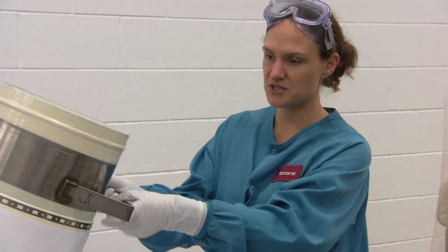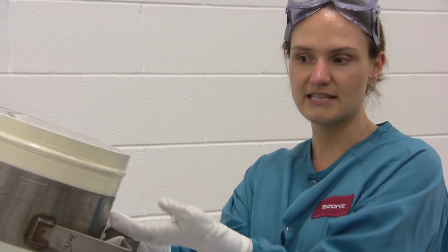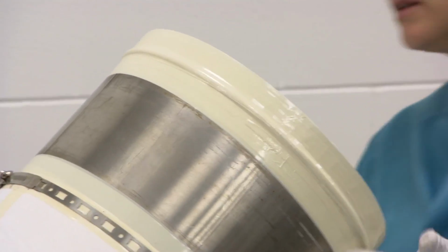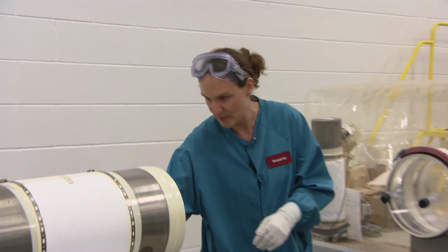And then also you want to make sure that this mylar doesn't extend beyond your tape. If it does, that could potentially create a channel of entry for air to seep through and into your cylinder. So once you've checked and everything looks okay, then we can go ahead and pop off our cap here.